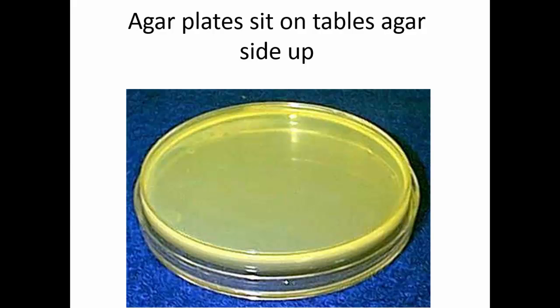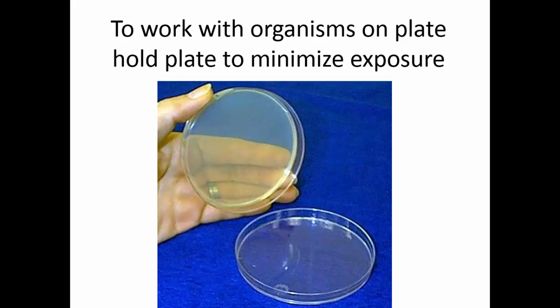One reason is that when you take the plates from the warm incubator environment and bring them into the cooler air environment of the laboratory, condensation may form on the lid. If you had the plate sitting with the lid up, that condensation, that water could develop or pool into one area and drip onto the surface of your plate. If microorganisms get into a pool of water, they can all swim together, so you would lose any isolated colonies you might have had. The other reason is it's just easier to handle the plates this way.